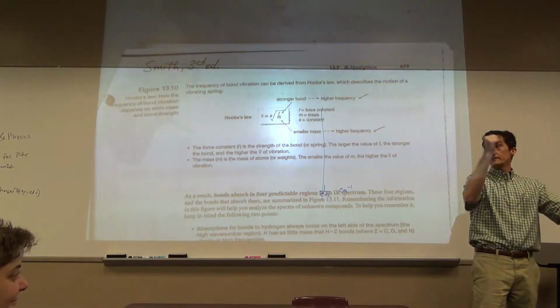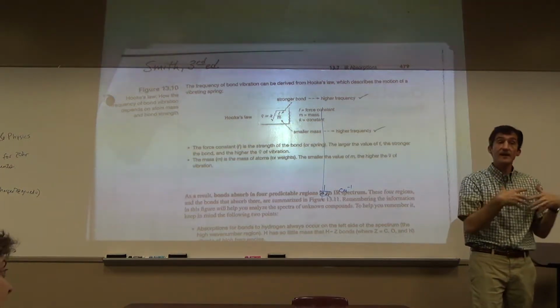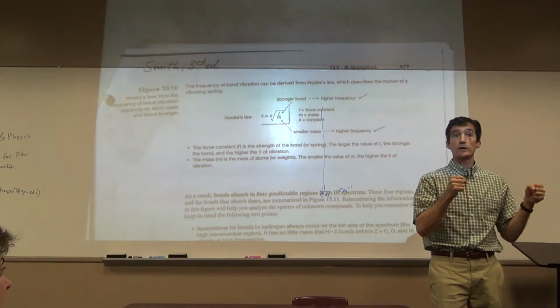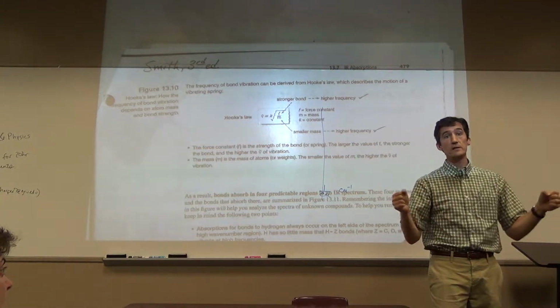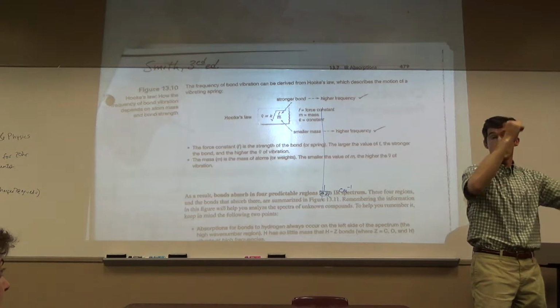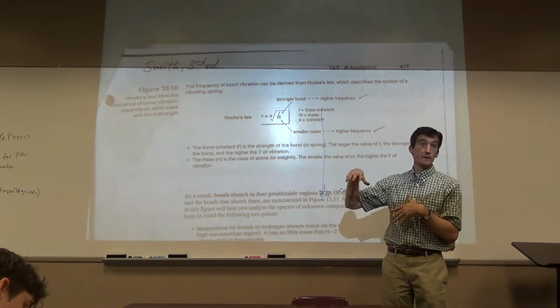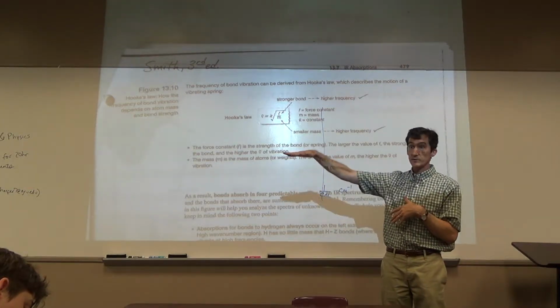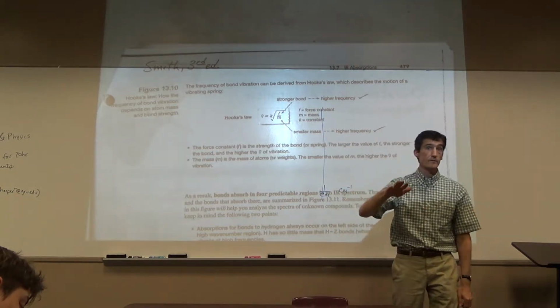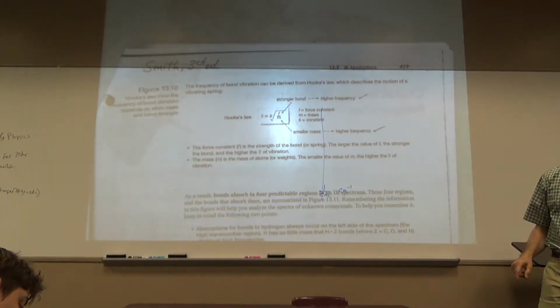What happened? I absorbed it and I went to a higher vibrational level. Now how did I actually absorb it? Well, that's probably a lot of physics. The idea is we go to a higher vibrational level. Do you agree that when I go from here to here, I'm at higher energy? The bond took on the energy. Because it took it on, it absorbed it. And we can plot that, because here's what we started with. If the bond absorbs it, then we have less, and we can plot that. So that's what we're plotting if you go back to the first page. The bond absorbed it.